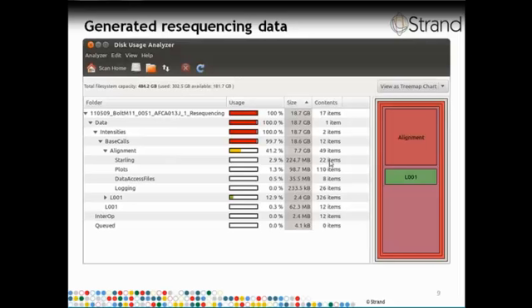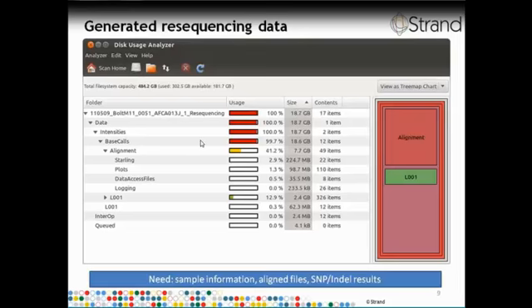To import all of this data into Avadis NGS, we can start by creating a new resequencing experiment. Internally, this means that we create an experiment of type DNA variant analysis. The resequencing was against the Rhodobacter sphaeroides organism. The annotations for this organism are available on the Avadis NGS annotation server, and you can directly download them through the annotation manager in the tool. After that, we specify the library layout, which is paired-end.